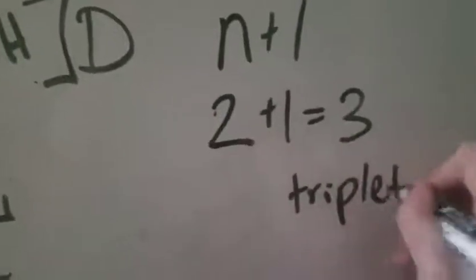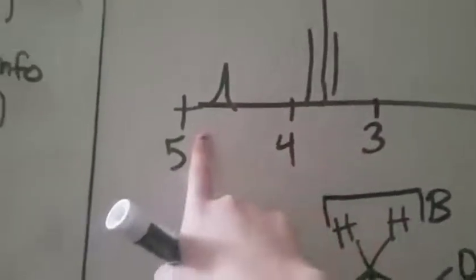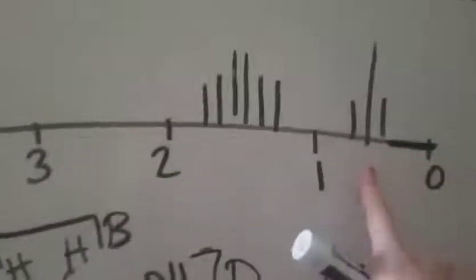So I hope you guys have talked about that. I'm pretty sure you guys have. So if I look up here, this is a triplet, this is a multiplet, this is a triplet, and this is a singlet. So either this one is for the CH3 or this one's for the CH3. And if you remember, downfield is over here and upfield is over here.